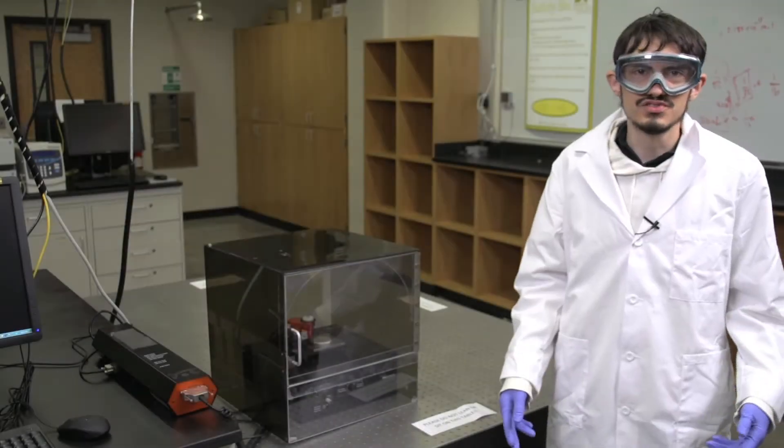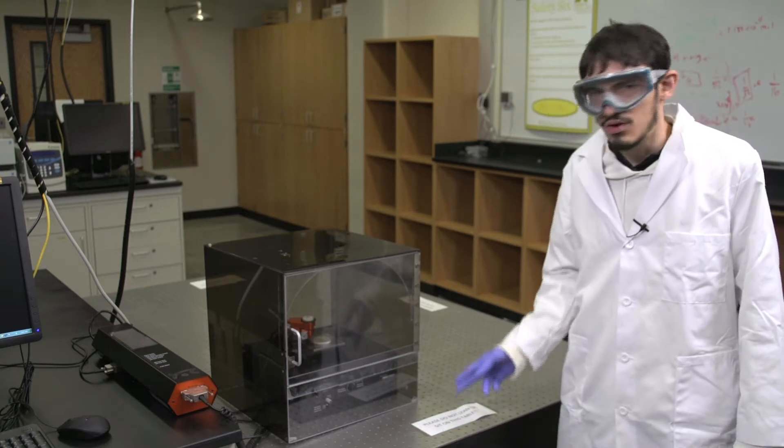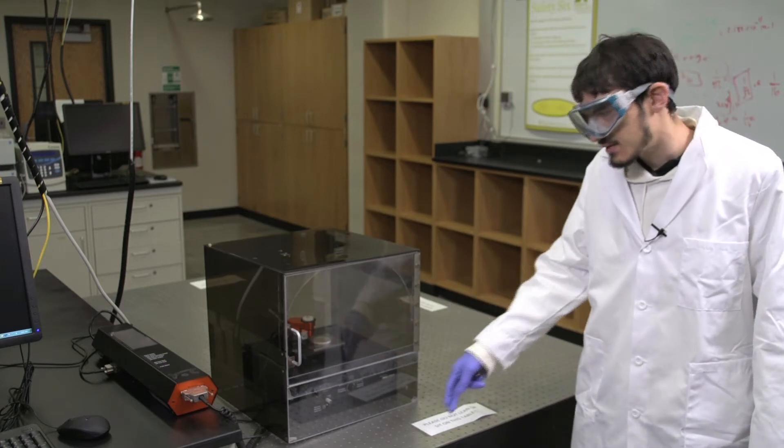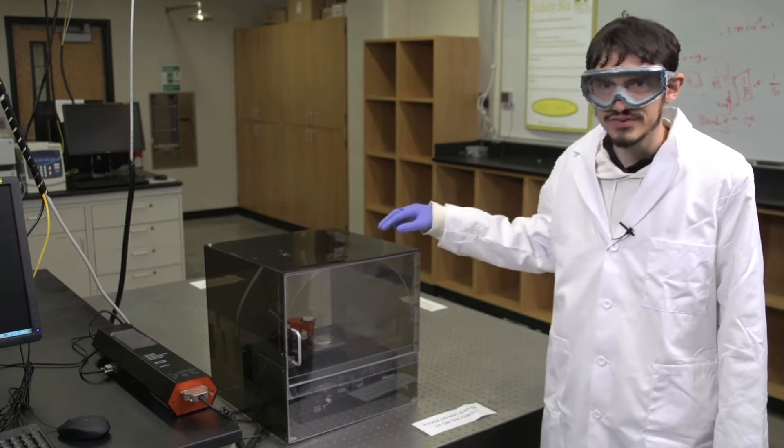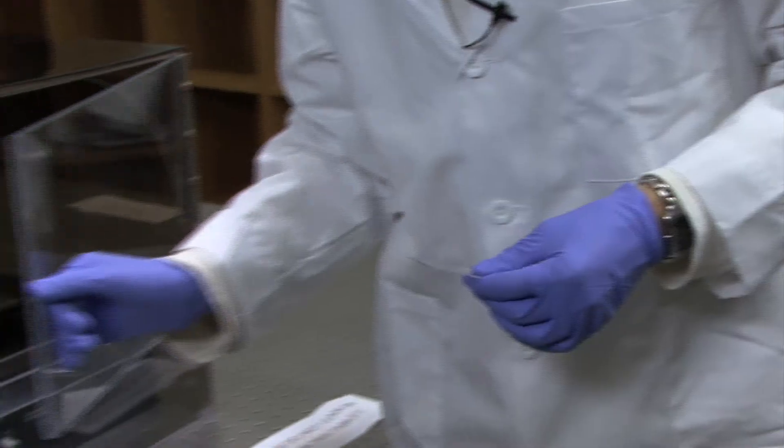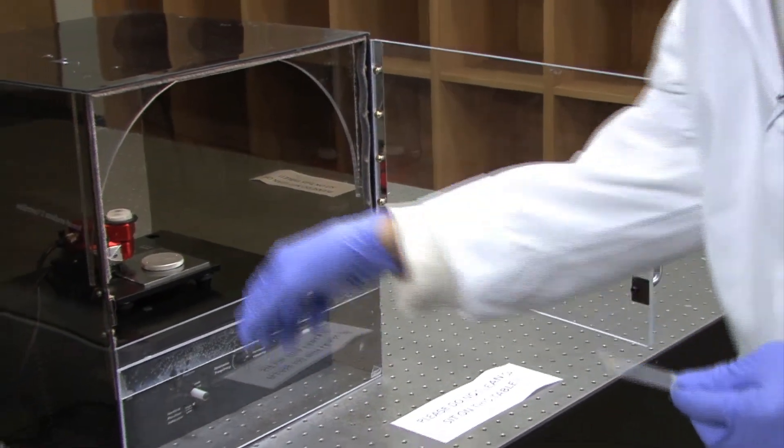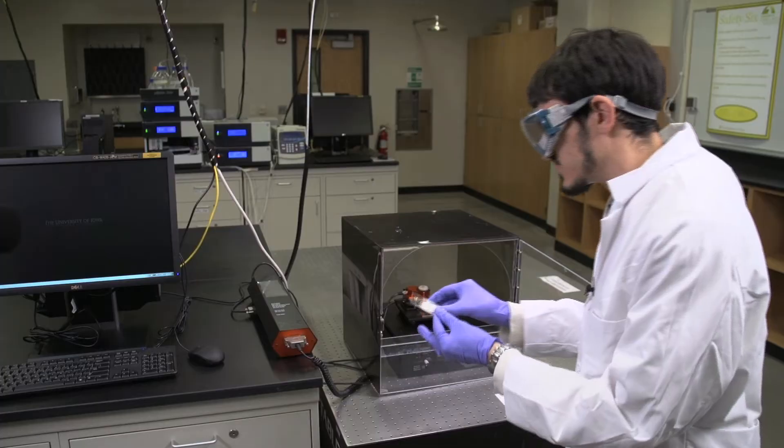When preparing to use the AFM, be sure that you do not lean, sit, or place any objects on this table. The draft box should remain on the AFM at all times unless the tip is being changed. Carefully open the door of the draft box and remove the magnetic sample stage.